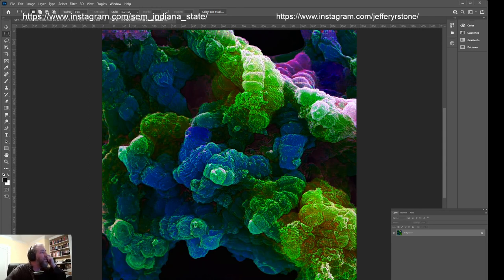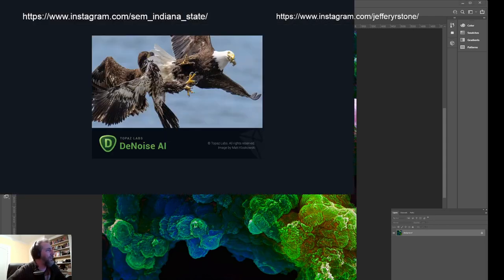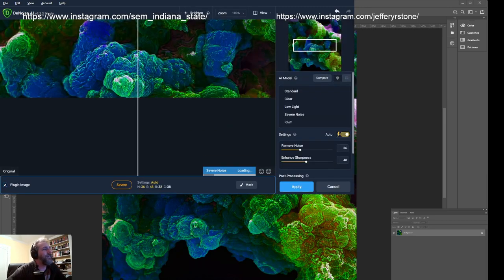Maybe about a month ago, I bought the Topaz tool sets. So there's a whole bunch of Topaz Labs tools that you can get for editing image quality. SEMs are very noisy. So one of the things that I do, Topaz is a really great tool, and it actually is built into Photoshop, so that you can just come in and go, oh, I want to denoise this image, get rid of some of the noise from it, and so I can just click that, and I think it's set up so you can see it.